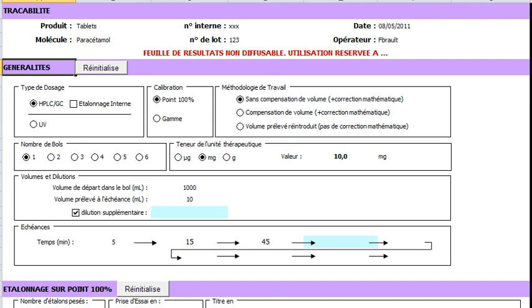Here we select the calculation correction, depending on the replacement or not of the aliquots withdrawn. The form offers three possibilities.